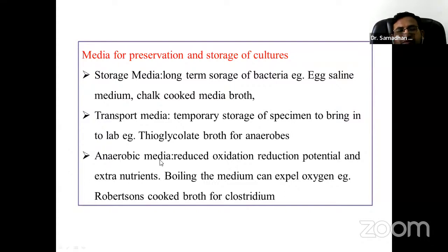Then anaerobic media, which require reduced oxidation-reduction potential conditions and extra nutrients. Boiling the medium can expel the oxygen, which can make it anaerobic in nature. The example of this media is Robertson's cooked meat broth for Clostridium.